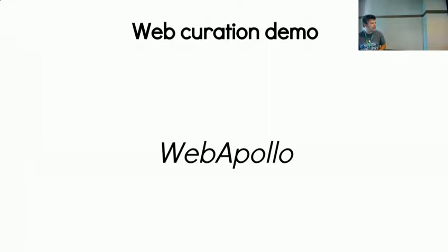Okay. And allowing people to come in and view additional data tracks is helpful.